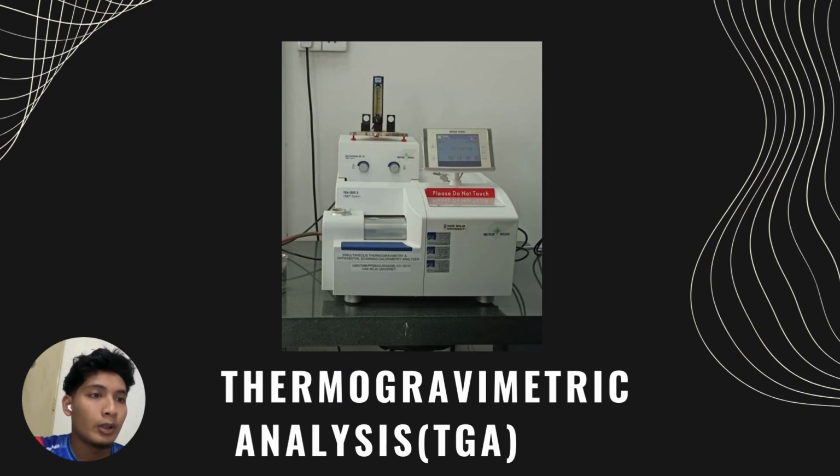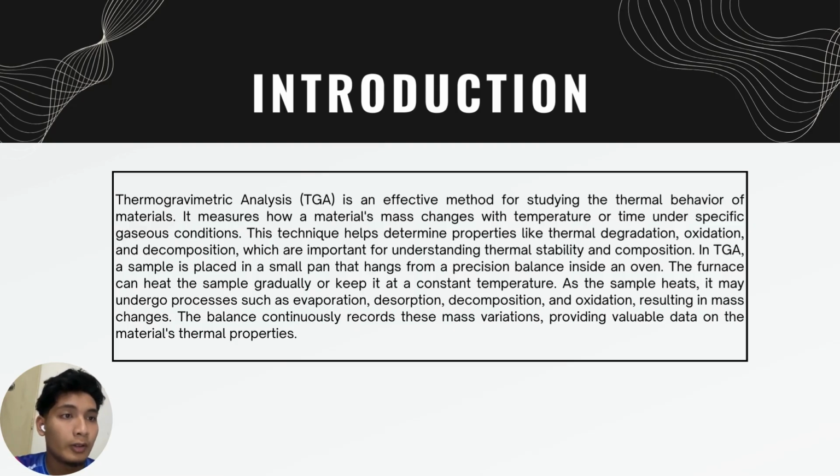This is a picture of thermogravimetric analysis, or TGA. Okay, for the introduction, thermogravimetric analysis, or TGA, is an effective method of studying the thermal behavior of materials. It measures how a material's mass changes with temperature or time under specific gas conditions. This technique helps determine properties like thermal degradation, oxidation, and decomposition, which are important for understanding thermal stability and composition.